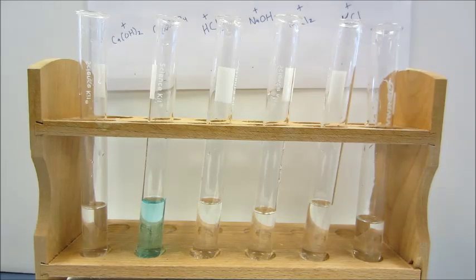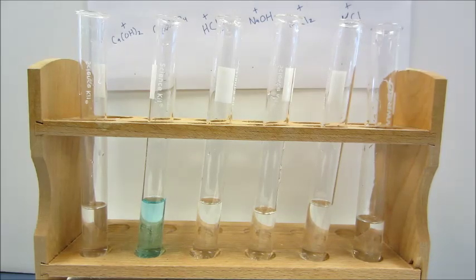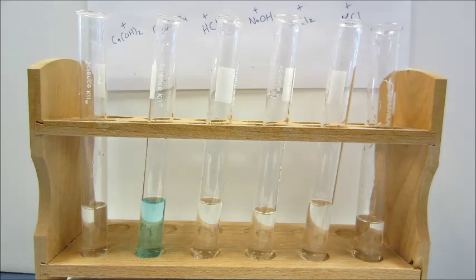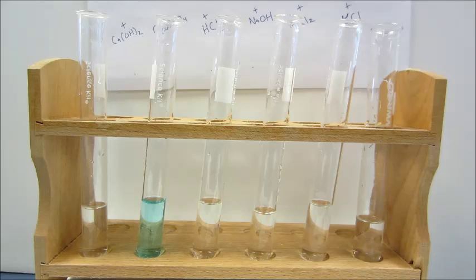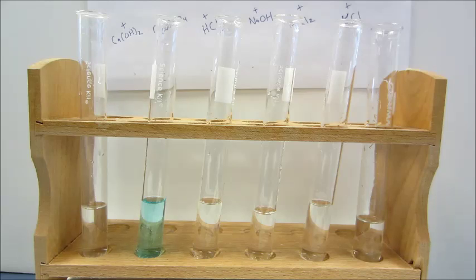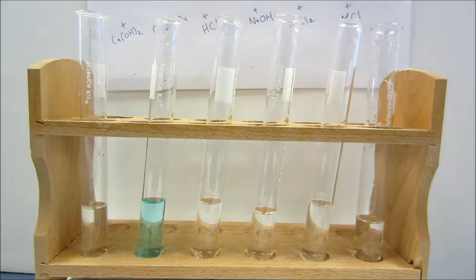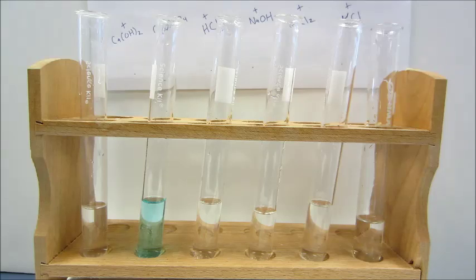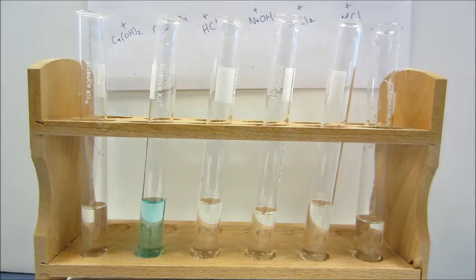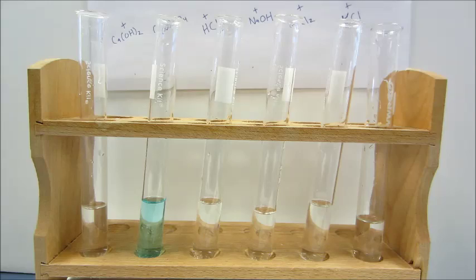Looking at these test tubes right now, I see no indication of a reaction — no color change, no bubbles to indicate a gas, no precipitate at the bottom. It appears that none of the salt water has reacted with these other compounds.